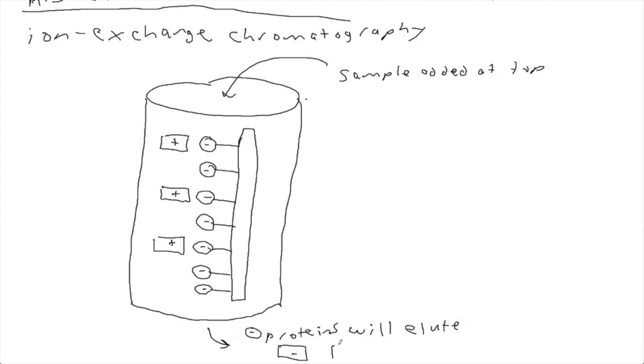So the negative proteins got out. And maybe also some neutral proteins got out. But the positive ones are more likely to stick. Do you remember that when we were going over peptides, I kept asking you questions like, what's the net charge of the peptide? Do you remember those types of questions? Yes. Well, this is why I was talking about that. Why would a chemist care what the net charge is on a peptide?